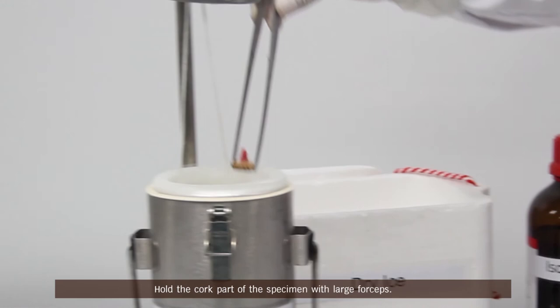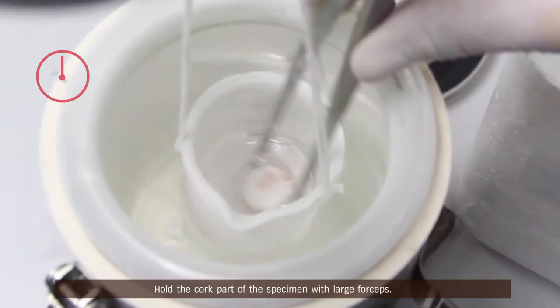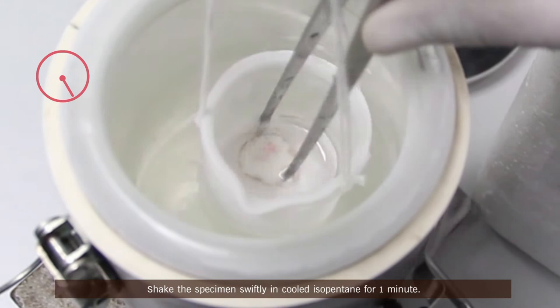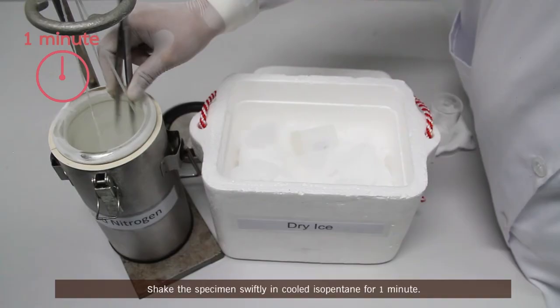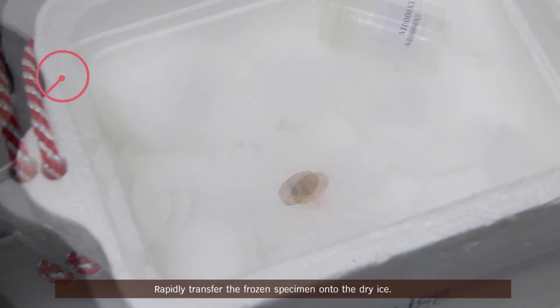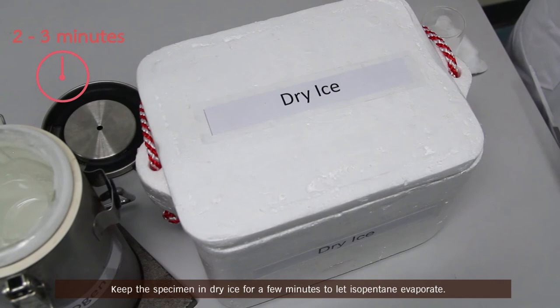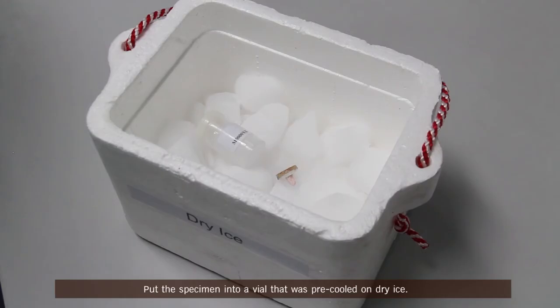Hold the cork part of the specimen with large forceps. Shake the specimen swiftly in cooled isopentane for one minute. Rapidly transfer the frozen specimen onto the dry ice. Keep the specimen in dry ice for a few minutes to let isopentane evaporate.